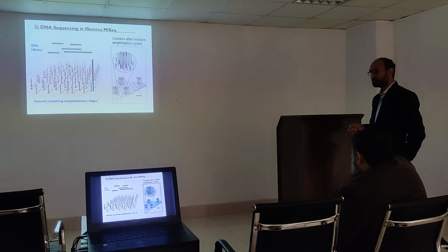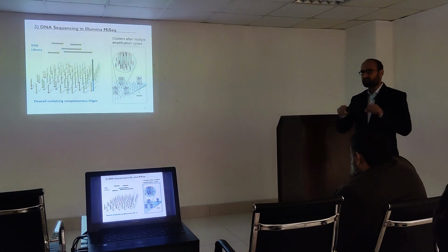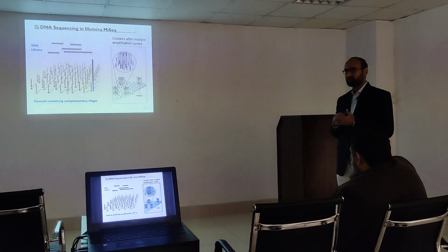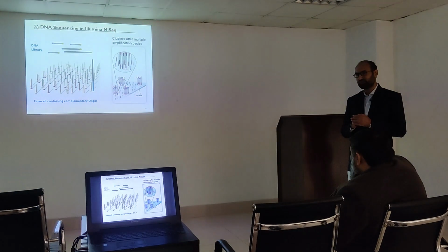The number of clusters is dependent on the kit which we are using. In Nanopore, there are no clusters.